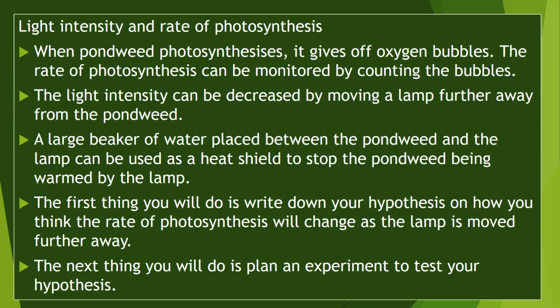So we're going to be using pondweed, or Elodea, and pondweed obviously lives in ponds, which is underwater. This allows it to give off visible bubbles of oxygen, and we can count those bubbles.